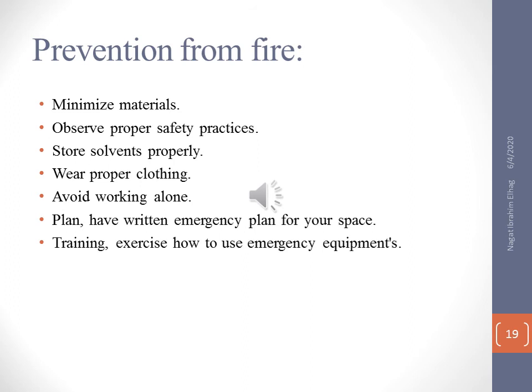Also, train and exercise those lab workers to deal with a fire when an emergency occurs, to make them safe and make your laboratory safe.